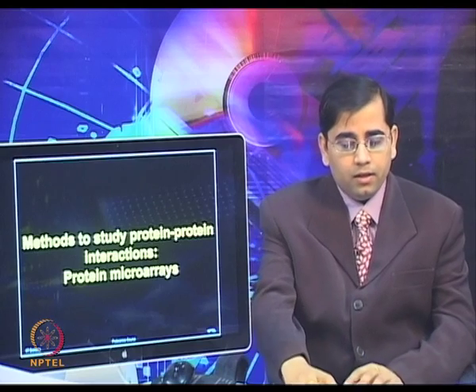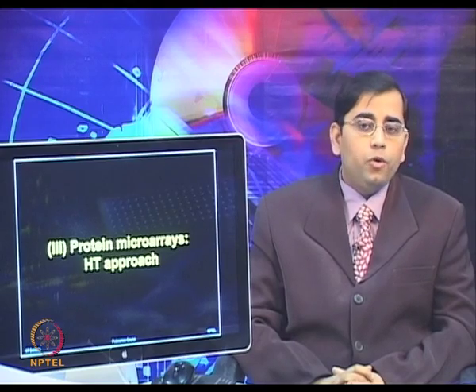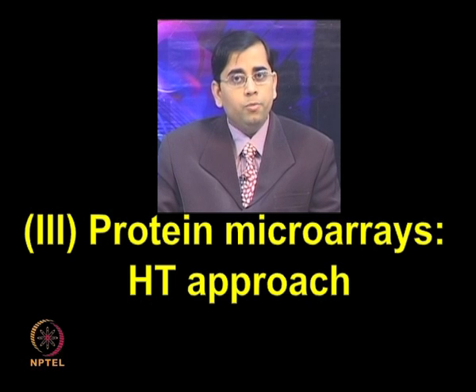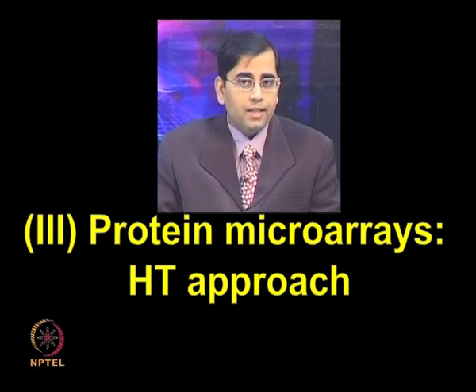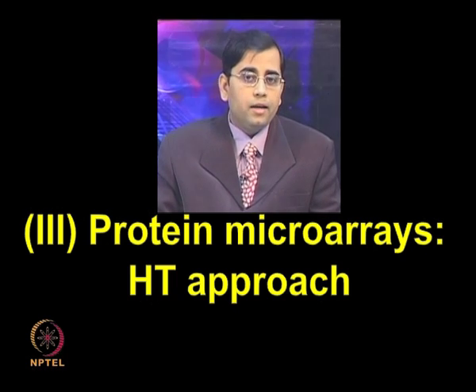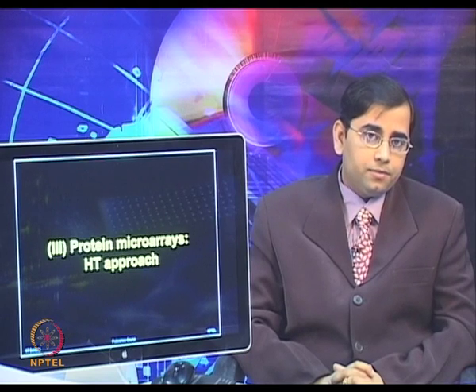So, let us first discuss some of the high throughput approaches, different types of protein microarray platforms. As we have been discussing, high throughput genomic and proteomic projects capture data at the scale of an entire organism and incorporate data into relational databases from which insight into various biological systems and organization of physiological networks can be derived. Different types of hypotheses can be made based on these large data sets.